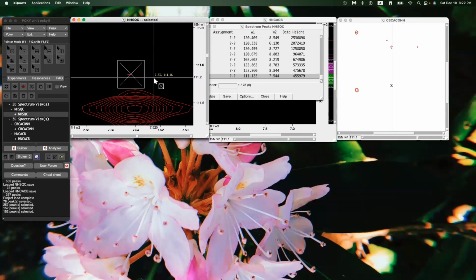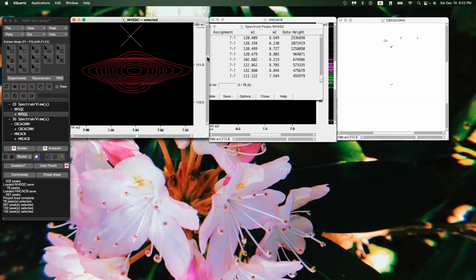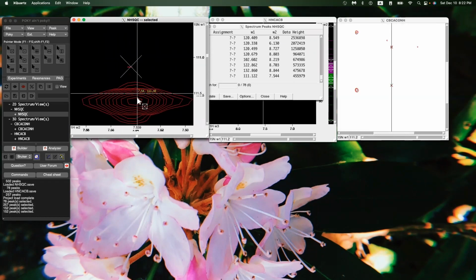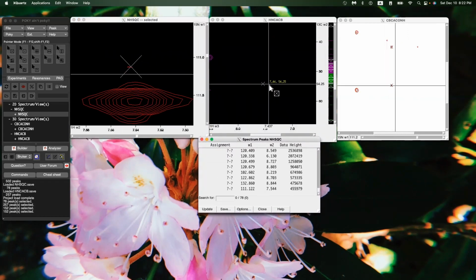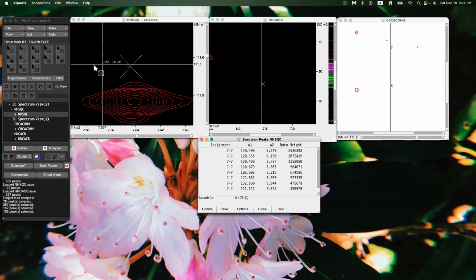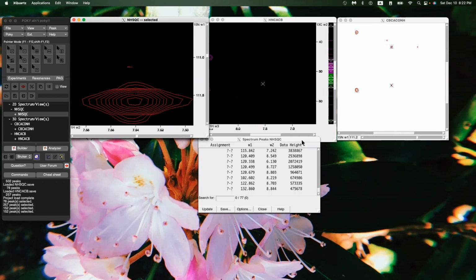You can see here that this is actually not a peak. How do you know it's not a peak? Well, if there was an X over a peak like so, then that is a peak, but otherwise it is not a peak. But actually, interesting. Oh, this is blocking the view. This right here shouldn't be a peak. So we can just select on it and then press Control D or the delete button on your keyboard. Not the backspace, but the delete button can also delete.